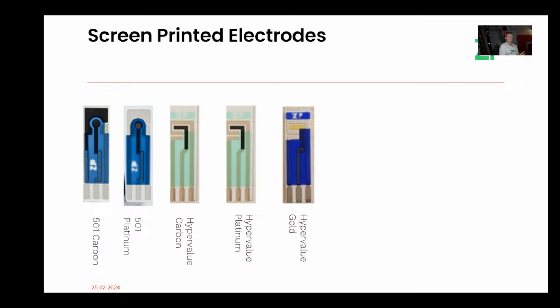And even if you were using peroxide enzymes, you can use catalytic materials on top of carbon to make it sensitive towards hydrogen peroxide. If you think you need to make self-assembled monolayers, you don't. You can use pyrene NHS coupling chemistry. So honestly, there is always a carbon equivalent or carbon way of doing things that you'd otherwise expect to be platinum or gold.